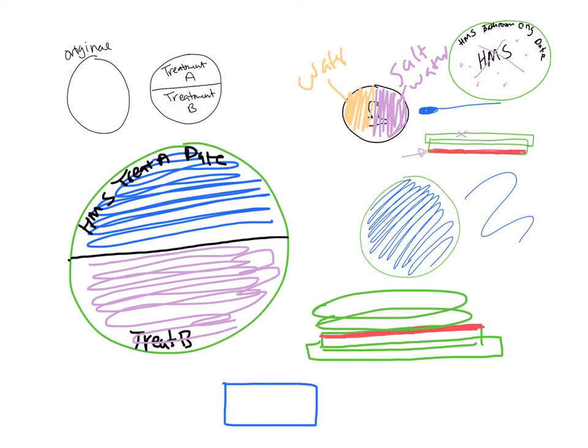And so you're just stretching it gently. It'll stretch pretty neat, actually. And you put it on one edge of the crack between your lid and your plate, and then you stretch it around the whole plate until it comes back to the beginning. If you don't have parafilm, we'll do that in class, just to seal it so it doesn't dry out and so you don't have any bacteria escaping. I'll put up a video about using parafilm as well, and you can see that.